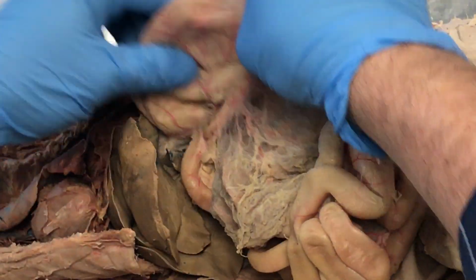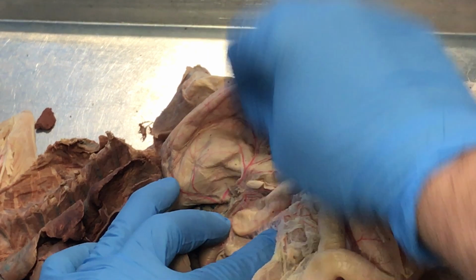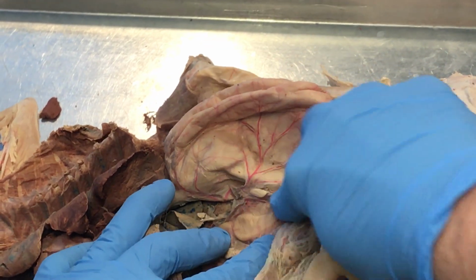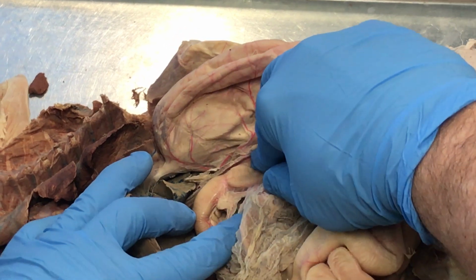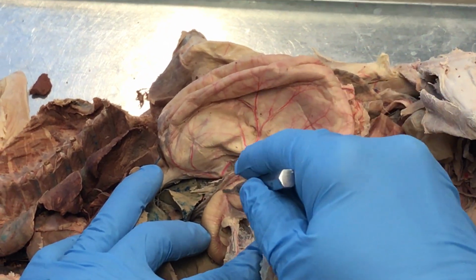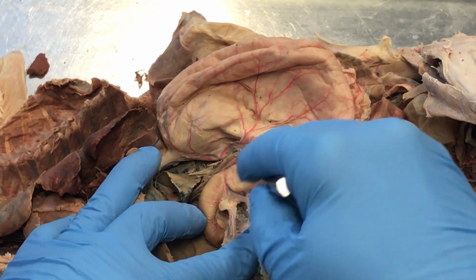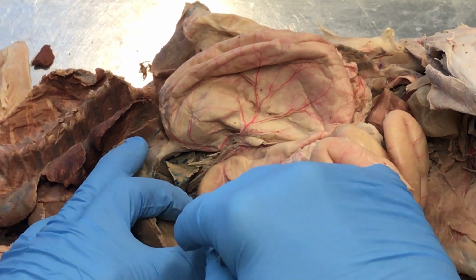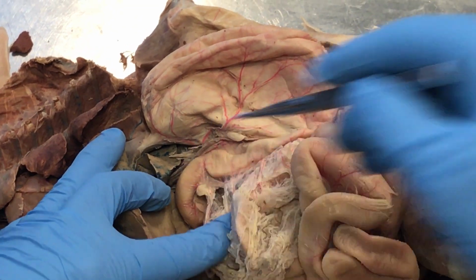Then it transitions down into what we call an antrum. Antrum means a room. It's basically where the stomach transitions into this space here, and then it narrows into the pyloric area, and the pyloric sphincter is going to be this narrow area right here. That's where the sphincter is. It separates the pyloric region of the stomach on this side from the first part of the small intestine, called the duodenum. So that's the duodenum right there.